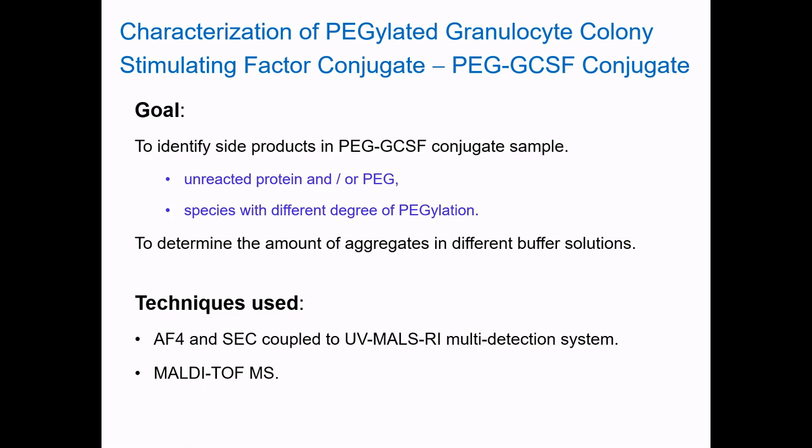Therefore, our goal in this case was to identify the presence of unreacted protein and/or polyethylene glycol in the conjugate sample, to determine the degree of protein pegylation, and to determine the amount of aggregates in different buffer solutions.